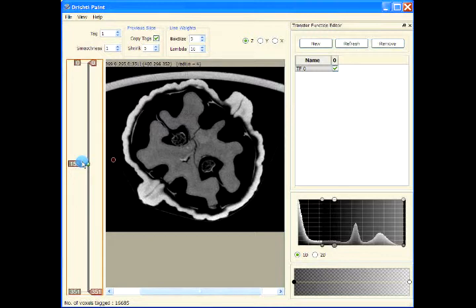painted the region, marking the region using the tags, and then we pressed T to tag the region. Then we pressed escape to remove the user painted tags. Then we use the copy tags option here to copy the tags from the previous slice to the next one, whether it is the one above or below the slice, and then pressing T to tag the next slice. Now we can automate this whole process. Let me show you how.